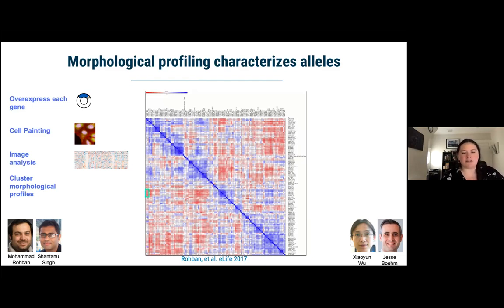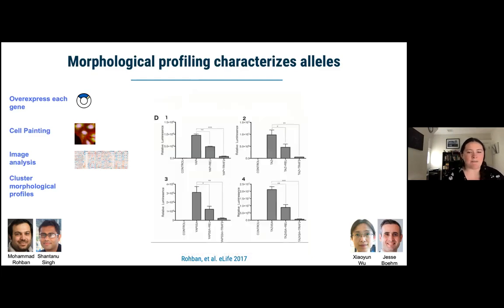But he also found at least one pathway interaction between the NF-kappa B pathway and the Hippo pathway that nobody we talked to could find any evidence for and didn't have any reason to believe was real. So we're a totally computational group, but we convinced somebody to build us a reporter assay.